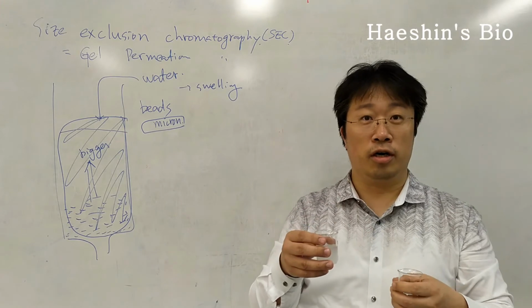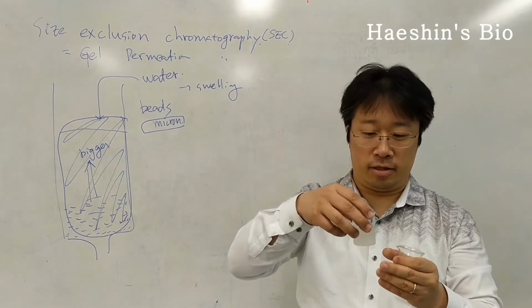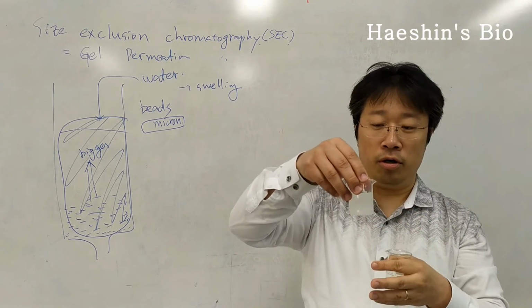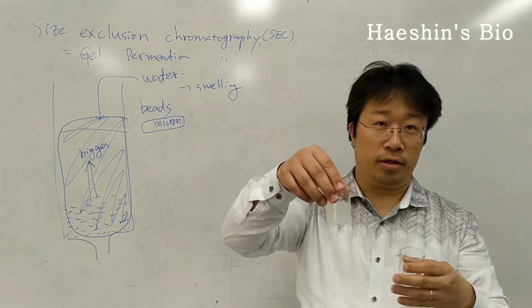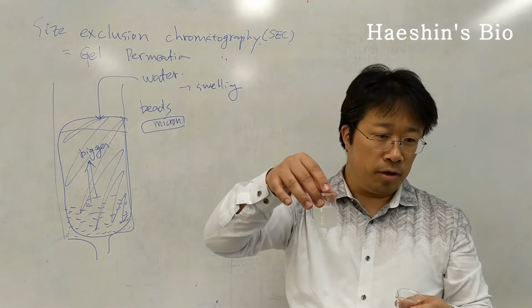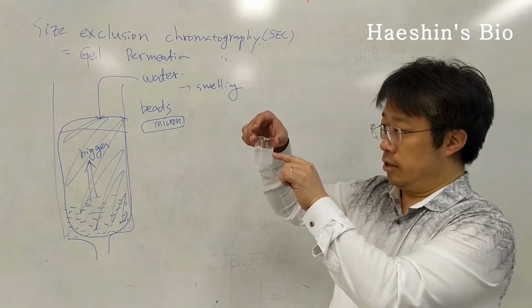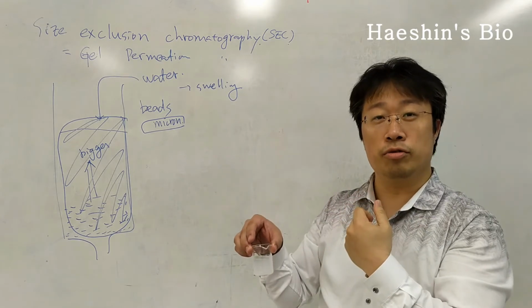And then I make a little shake, like the rice particles you can imagine. By stirring and shaking, I can provide more water to the beads so they swell much faster than if I just put in the water and let it sit here. You will see in a minute that these particles swell and become heavier and heavier as the water molecules go into the beads.